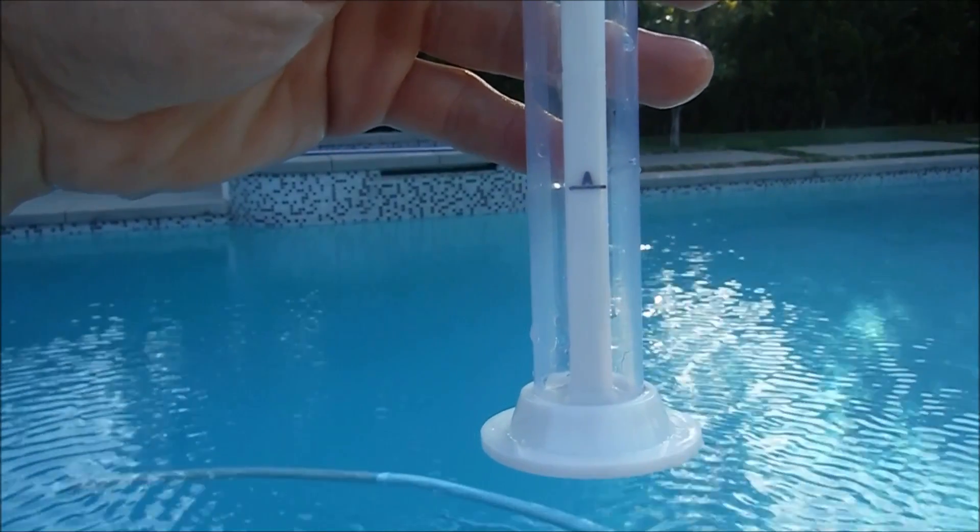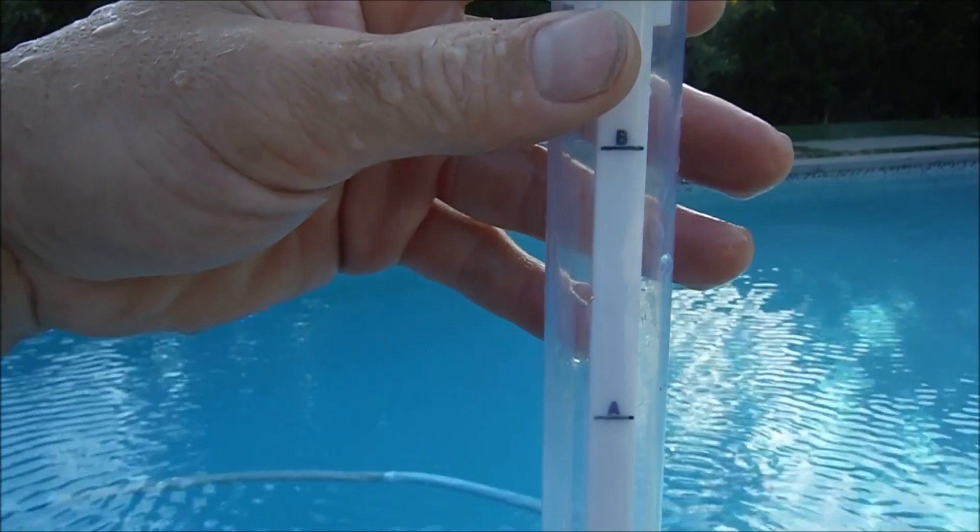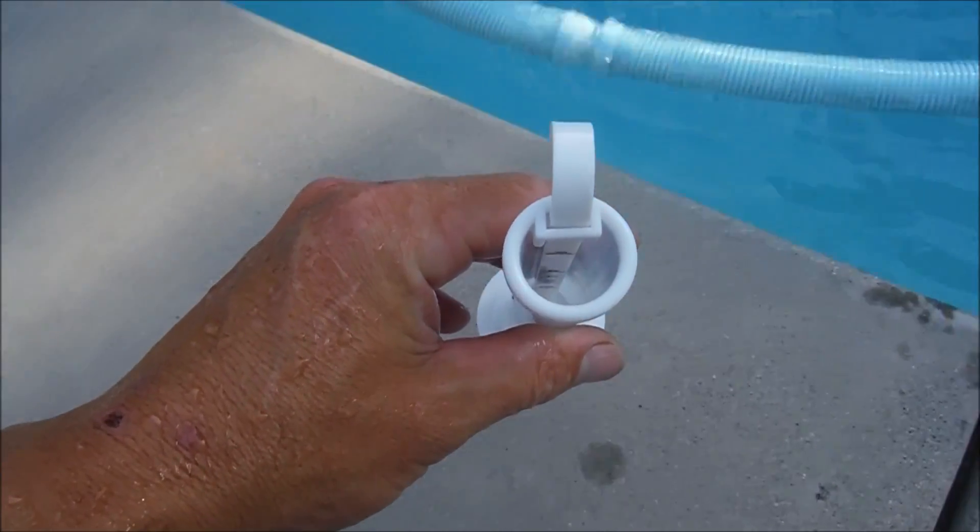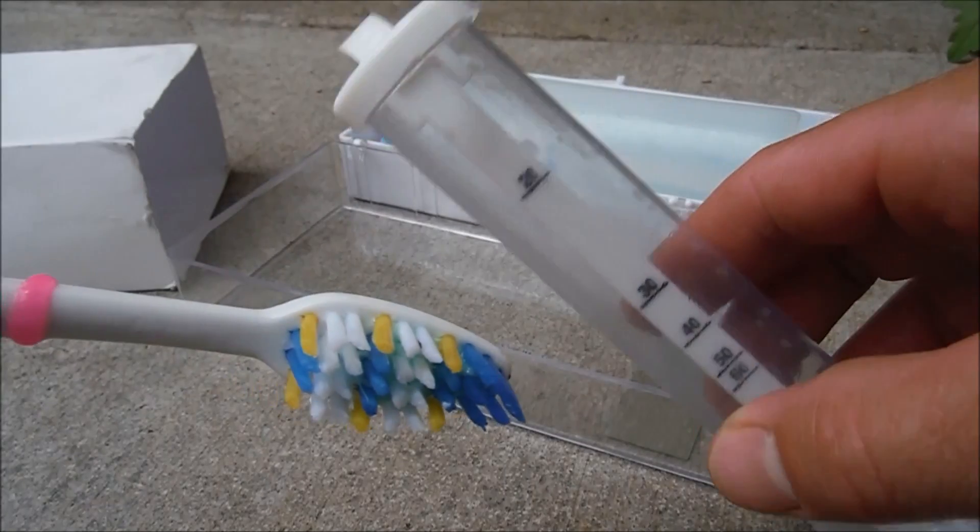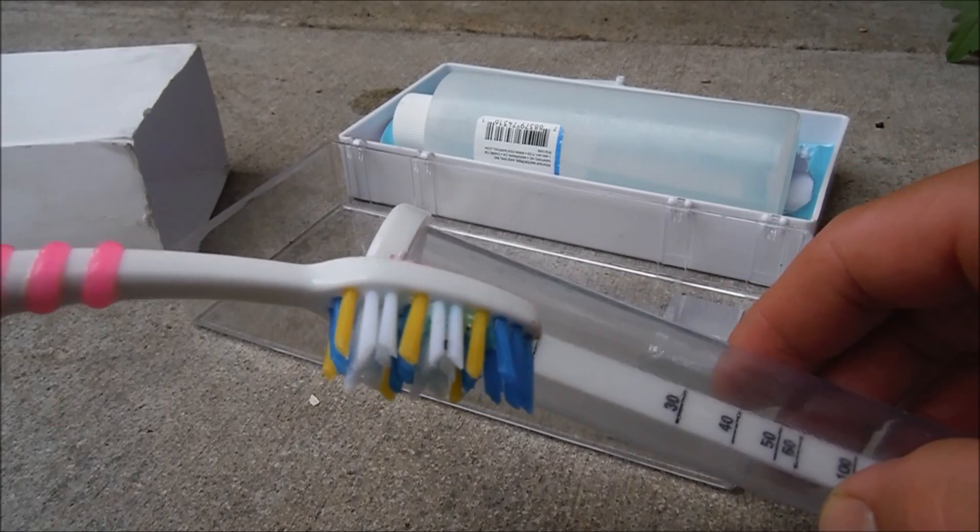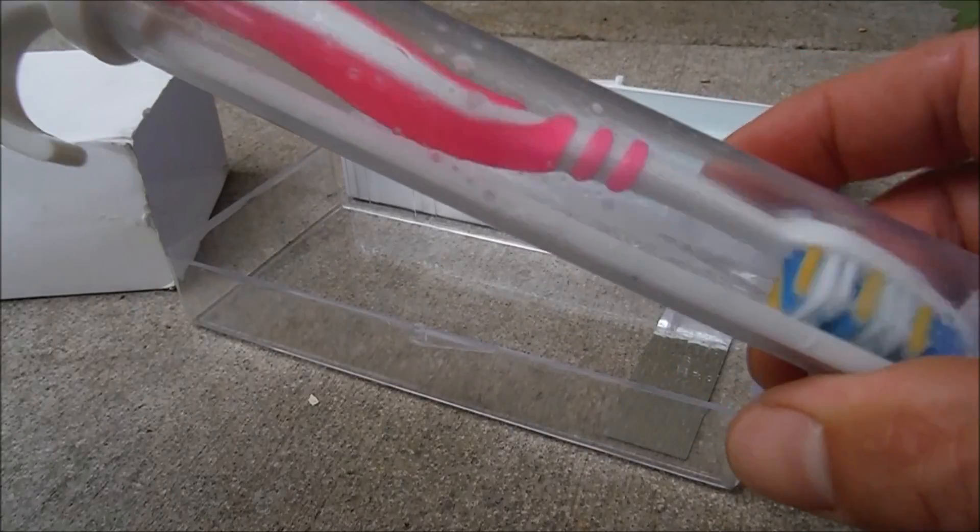We're going to fill up to line A with pool water and then up to line B with the test solution. Make sure you start with a clean tester and in between uses you want to make sure you clean the tube really good. You can use a toothbrush with some soap on it. Just get it in there and clean it really well.